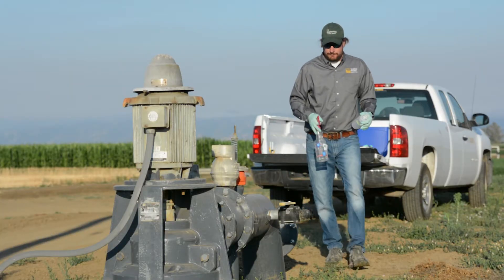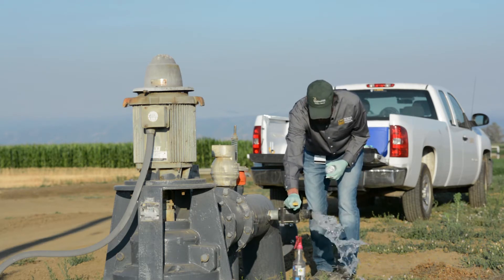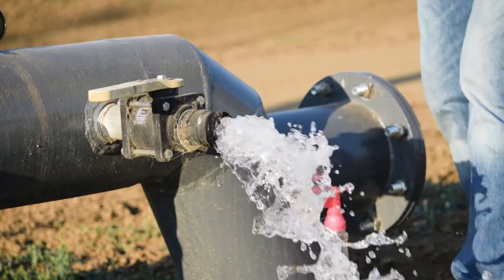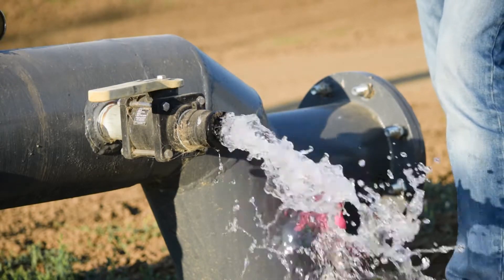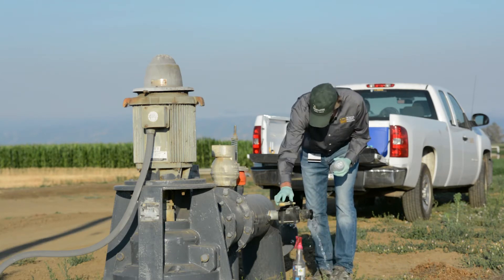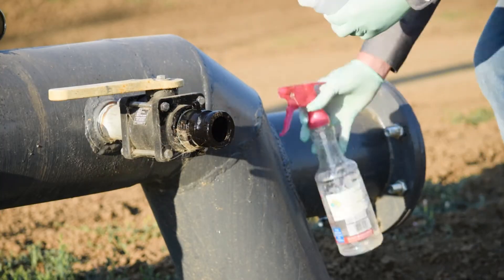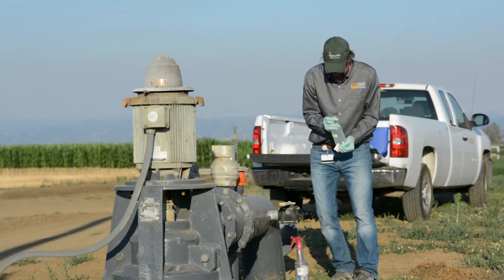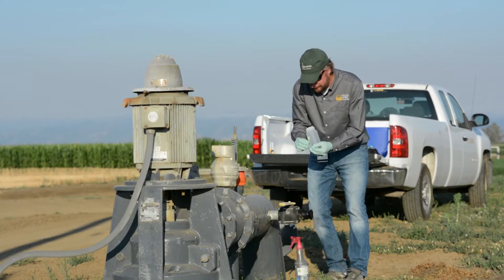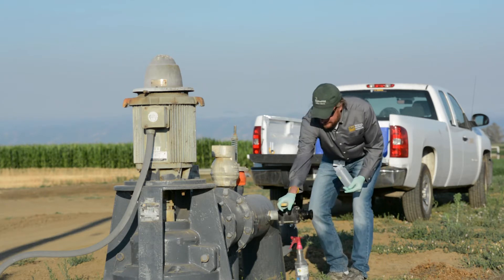When sampling a piped water system, the main difference is that the water is collected from an open spigot. Find a sampling point with a spigot or other hand valve that is as close to the outflow point as possible. Open the valve and flush for 2 to 5 minutes to clear the pipes. Turn the water off and clean the spigot with alcohol. Then flush again for about 30 seconds.